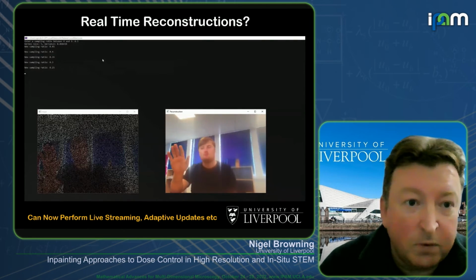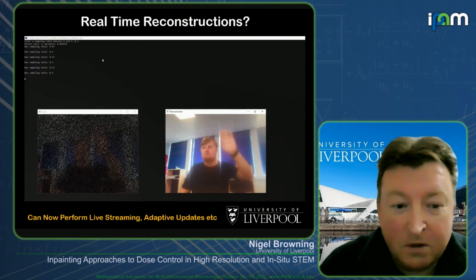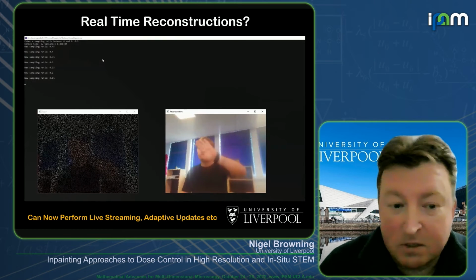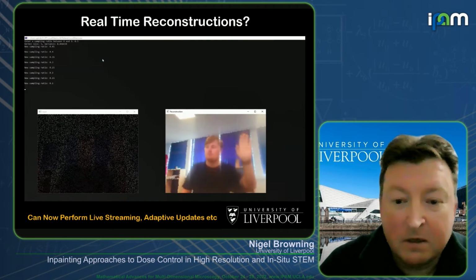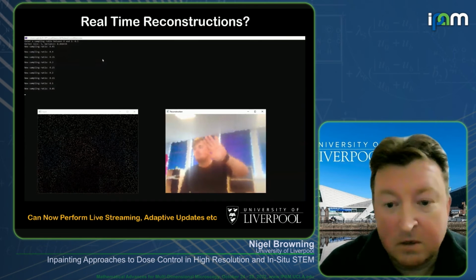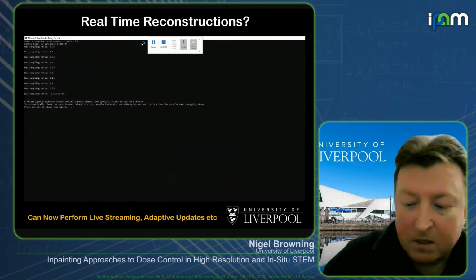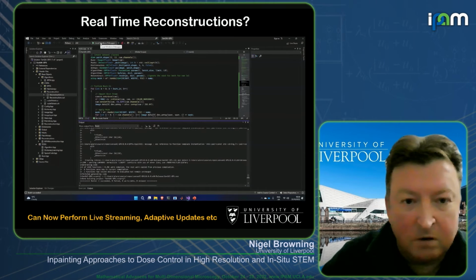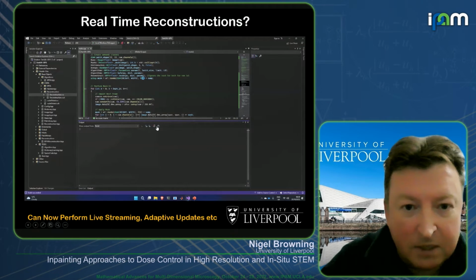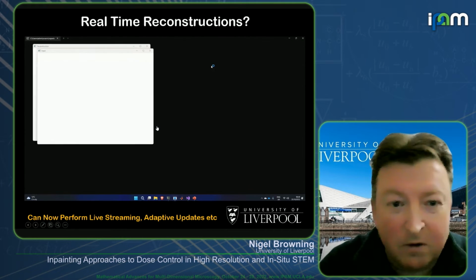This is using just a simple local means reconstruction. And you can see it's slowing down the actual webcam to get the reconstruction to work, simply because the algorithm has to work a little bit harder to get the reconstruction as you go down to 10% of the data. But still, you can see this as a frame rate that's moving. Now, if we go a little bit further and run BPFA, with BPFA, as you get going, it actually gets faster. I'm sorry, Alex didn't turn his microphone off here, so there are a few noises in the background.